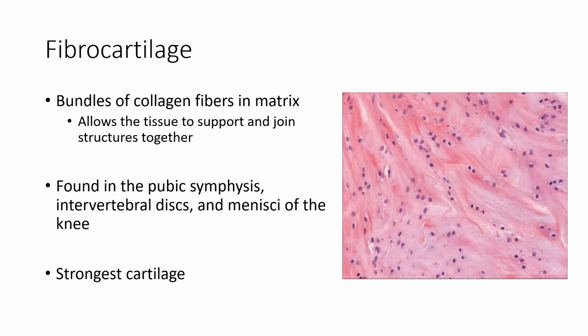Now, fibrocartilage is a little different, right? This doesn't look like bubbles. Well, depending on the slide you look at, you might actually be able to see some of the lacunae a little bit better. But one of the ways to remember what fibrocartilage looks like is to look at the matrix. It looks like brush strokes. These collagen fibers are so thick, they look like brush strokes. So it's like a beautiful watercolor in the background. Sometimes the watercolor is pink, sometimes it's purple, and sometimes it's blue.